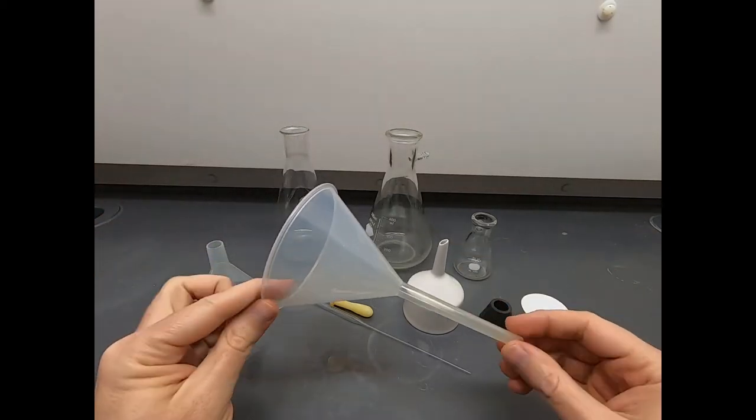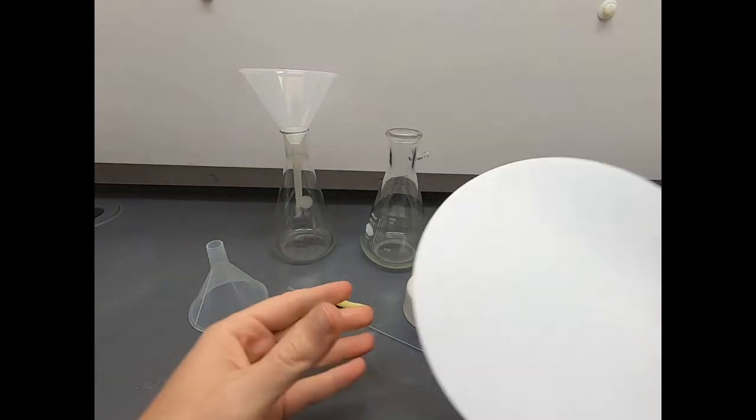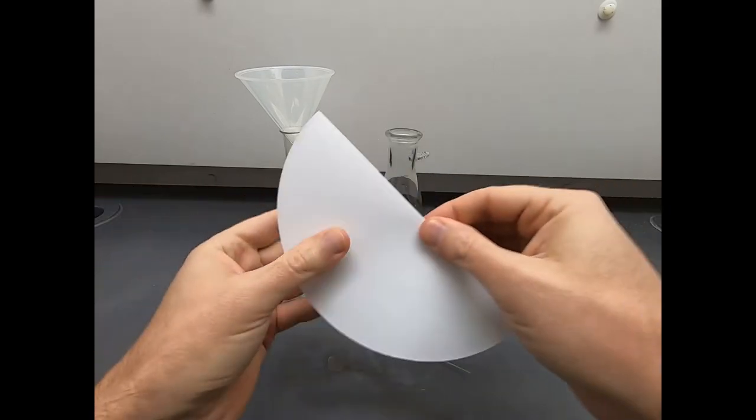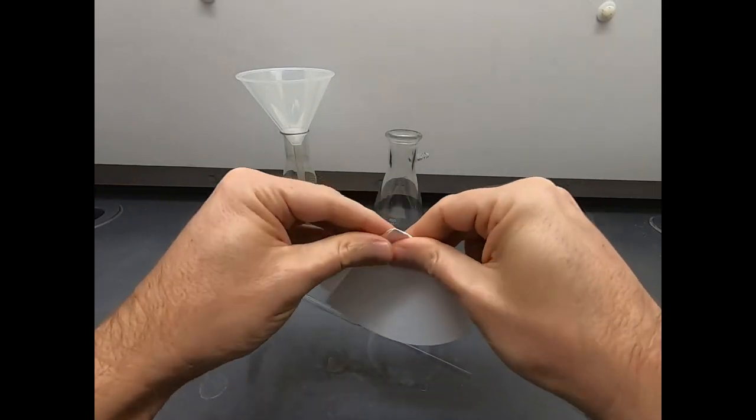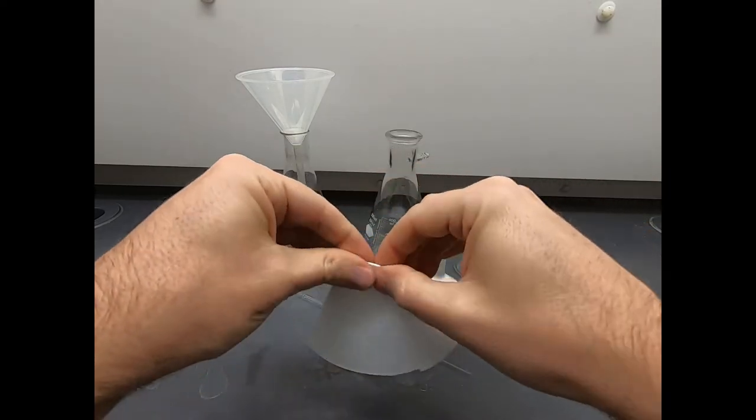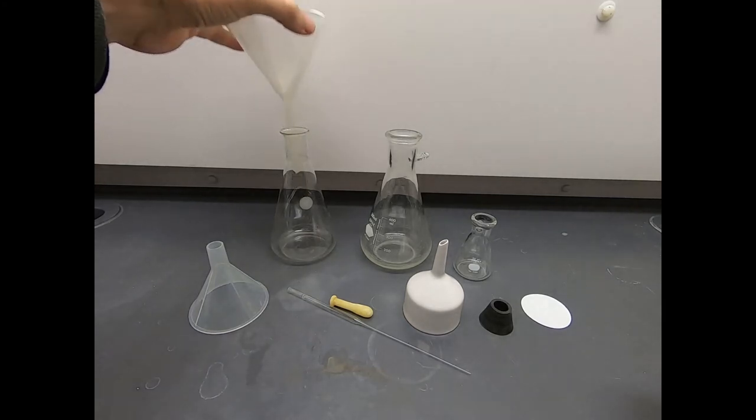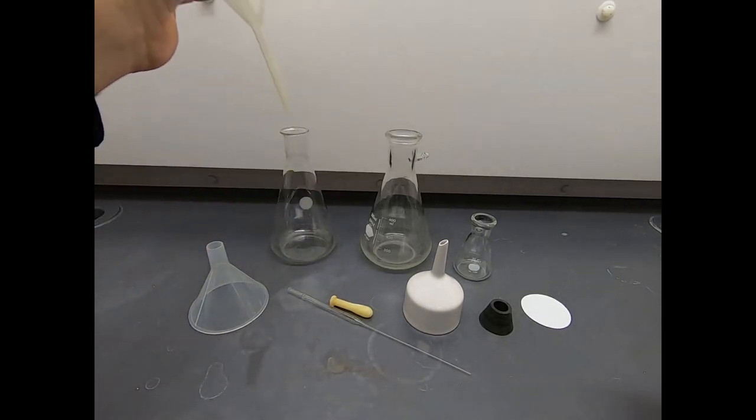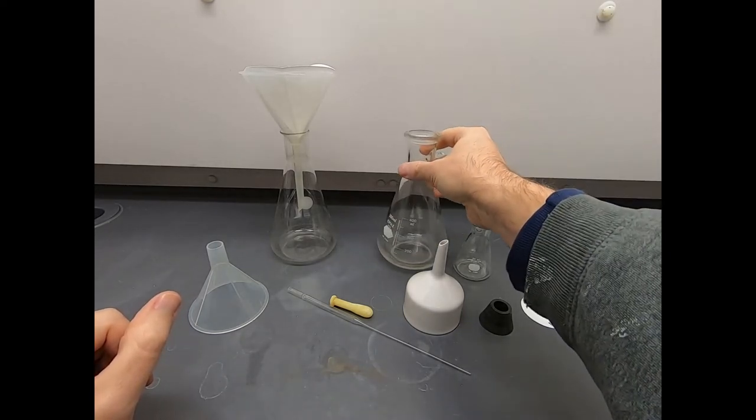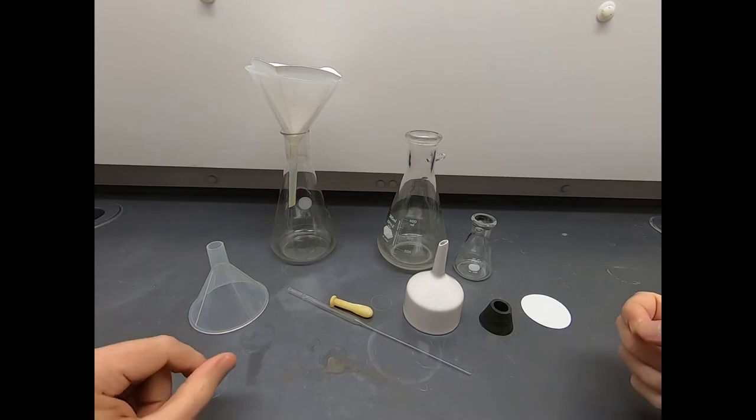Here is a gravity funnel. It's designed for liquids. It has a long narrow stem, so liquids will freely flow through that stem. To use this funnel, you'd want a piece of filter paper in here. We can fold it in half, fold it into a quarter, and then open it back up. There's a little pocket. Every lab has a drawer somewhere that is full of different filter papers that do different tasks. Here is a funnel with a filter paper, and it's ready for gravity filtration. We would pour liquid in, and the solids would be caught in the filter paper. For gravity filtrations, you typically don't want the solids. You want the liquid in the bottom.